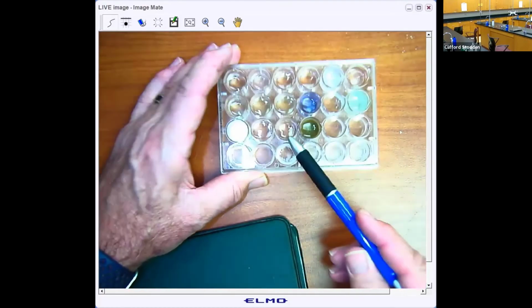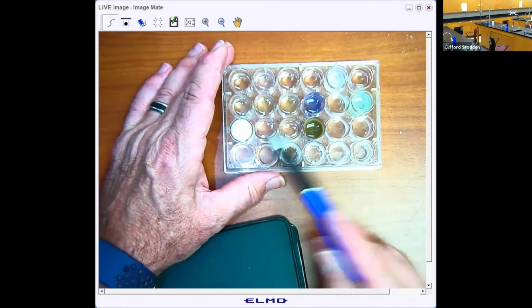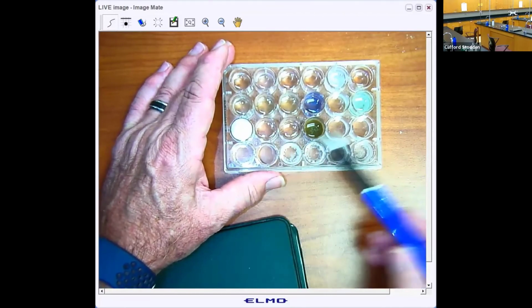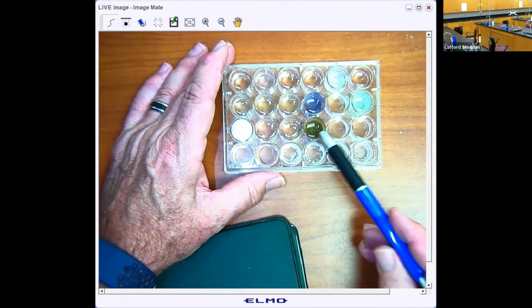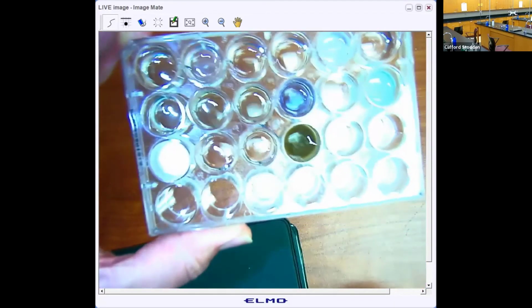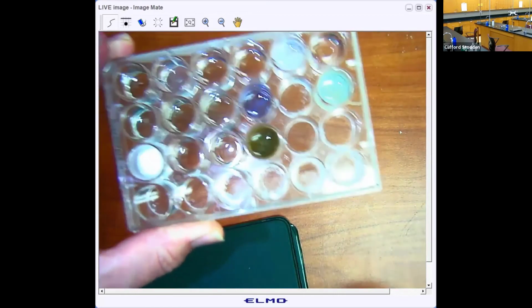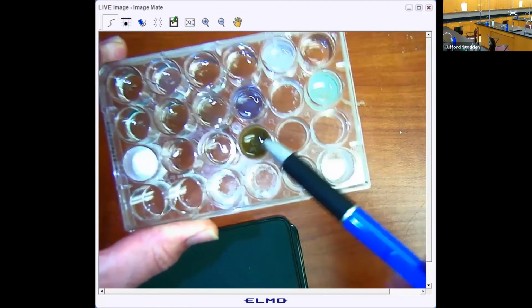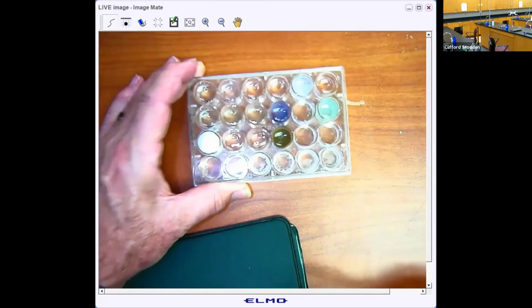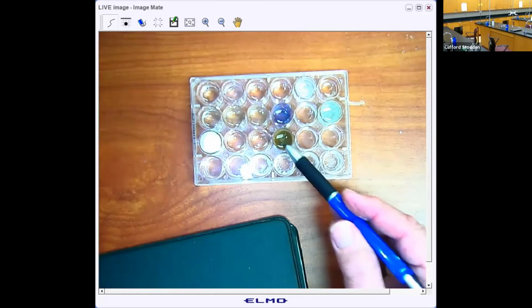Look, I can't see anything in that either. So the ammonia and the sulfuric acid are both no reaction. This is very interesting though. This is sodium hydroxide with the silver. Look at that precipitate. It kind of looks greenish on the camera, but it's really a brownish color right there. So remember that, because that could either help you identify the silver or the sodium hydroxide.